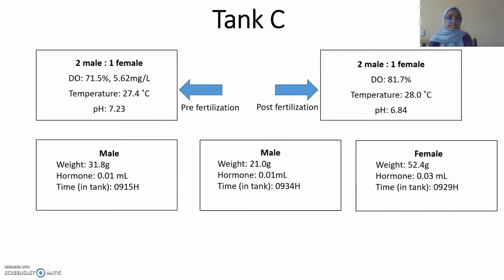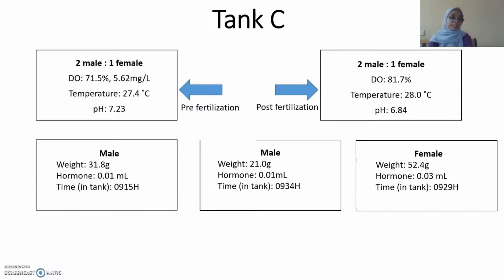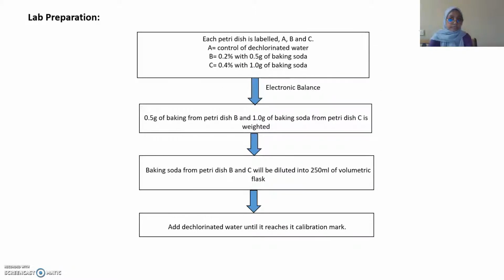For the pre-fertilization, the time was 9:02 a.m. For the post-fertilization, it was about 7:14 a.m. But we took out the fish eggs around 7:04 p.m. Now, let's move on to the first part, which is the lab preparation.